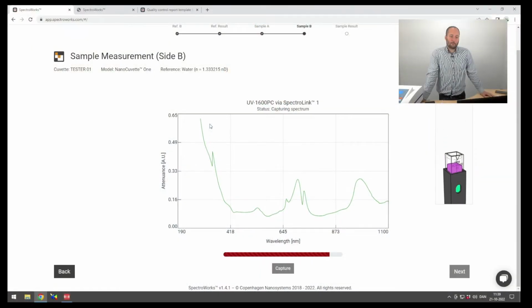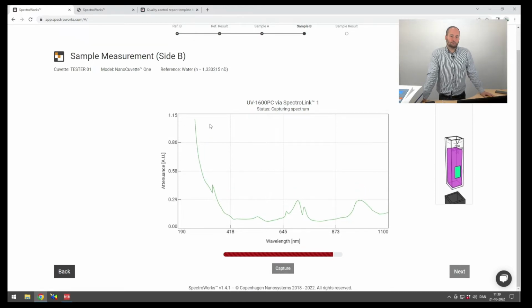Yeah, I mean that's important because titanium dioxide is almost black just before it's perfect white. Yeah. So you don't want it to be in a transition between the two. Yeah.